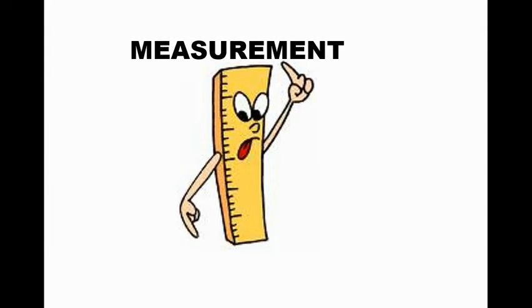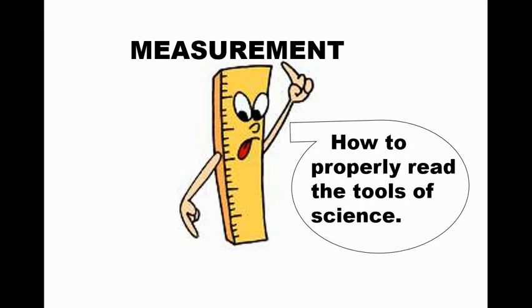Okay, chemists, today we're going to learn how to read measurements. So you may think you know how to read measurement tools, but there's a specific procedure for it, and we're going to learn how to do that today.